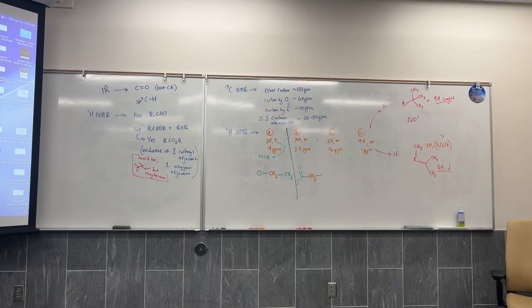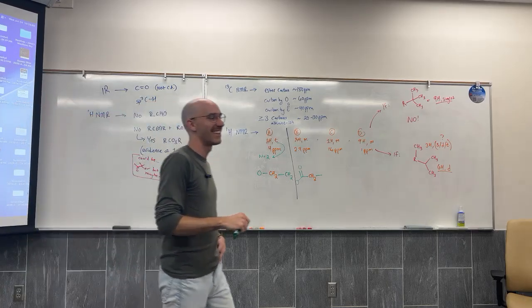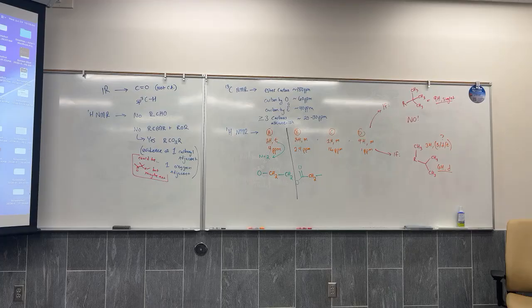How many peaks did we think it was? I said multiplet. I was going to say maybe less. Maybe it's 4. Is it easy to see on your sheet? That's how hard it's going to be to read on the test, too, which is why I will not make these so hard that you have to try and guess at this kind of stuff.